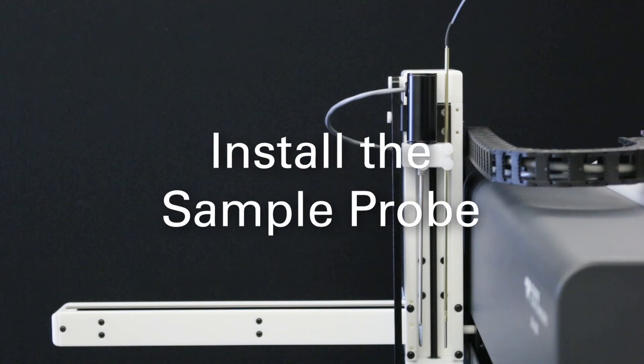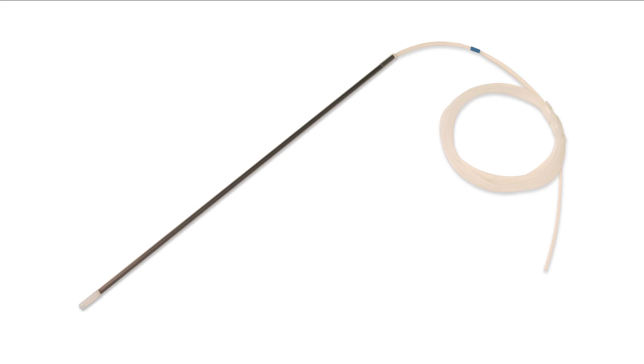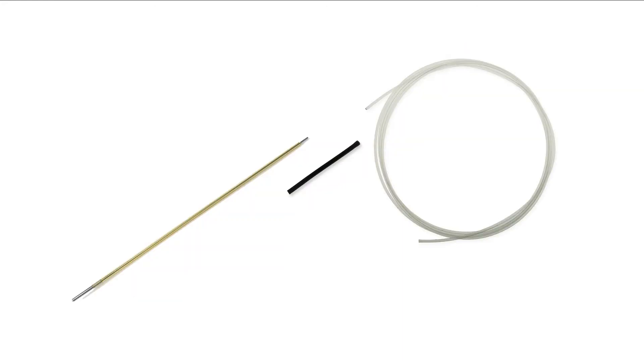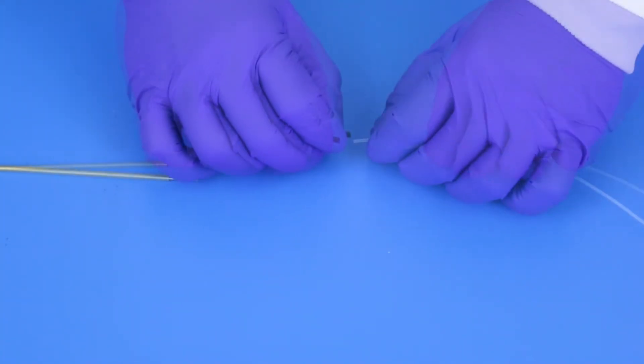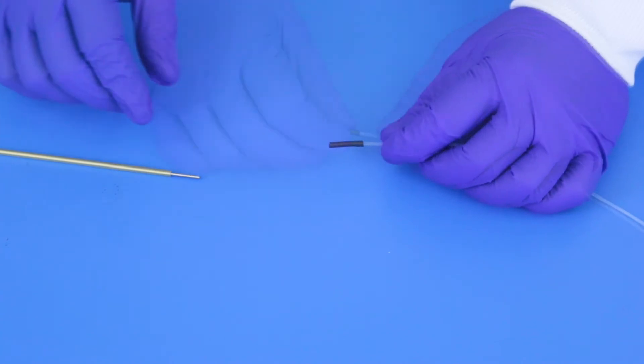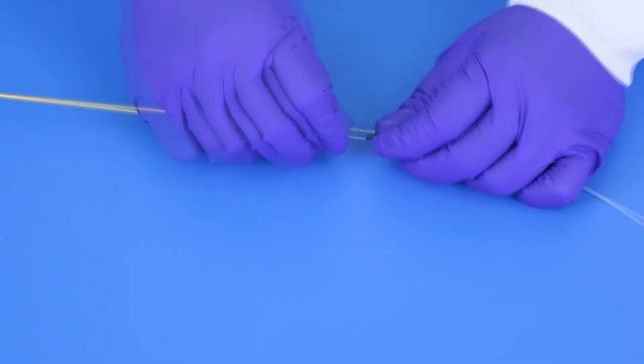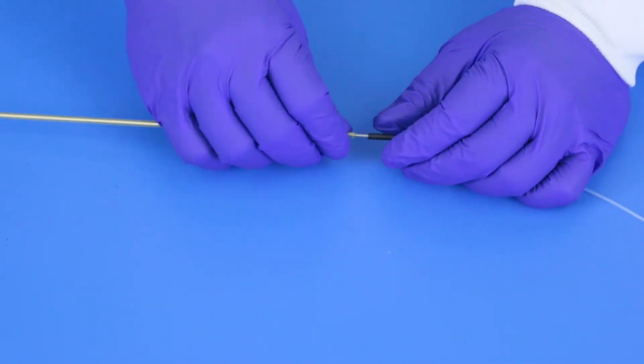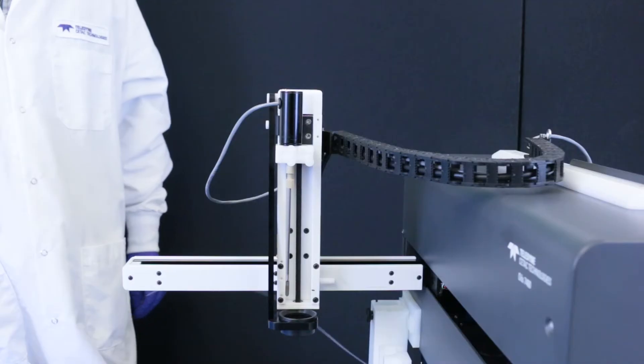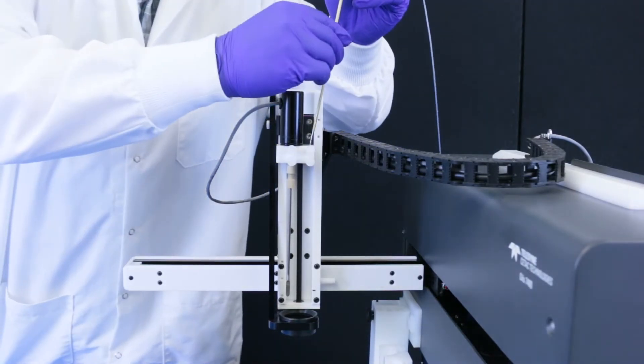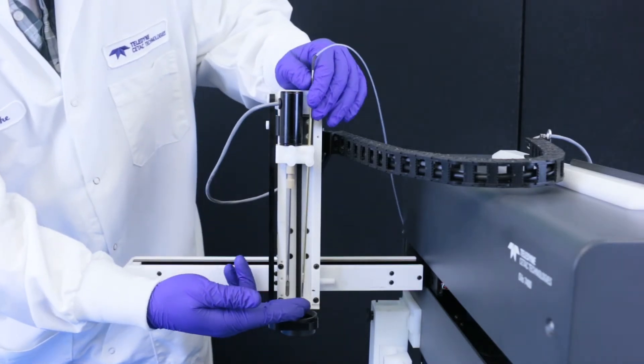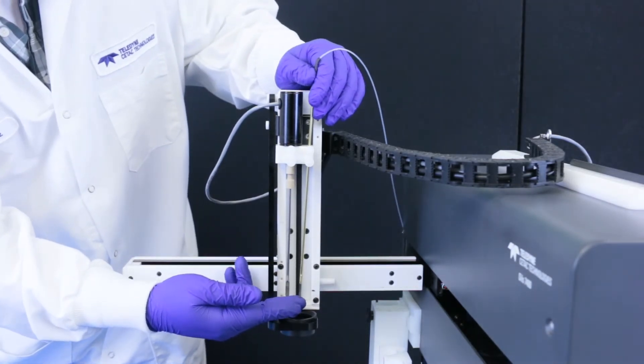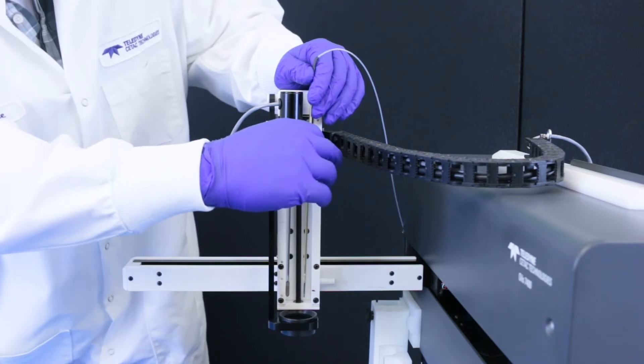Install the sample probe. Choose the appropriate probe for your application. The aqueous probe has an integrated capillary and can be installed directly. The OILS probe has a filtered tip. The included capillary must be attached before installation. To attach the capillary, use the short piece of black tubing and insert the capillary and the probe into either end. Once you have selected your probe, guide the probe straight down through the small hole in the Z-Drive. Adjust the height of the probe so that the tip is level with that of the stirrer paddle. Tighten the thumb screws.